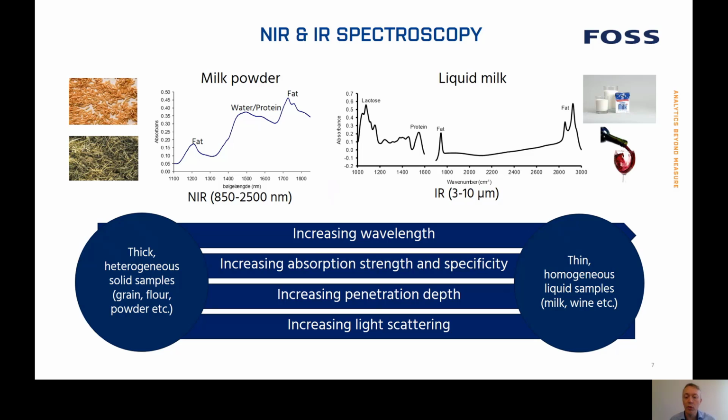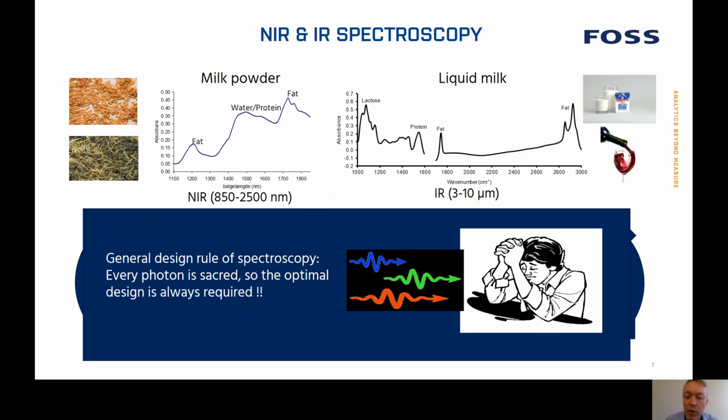In this webinar, we focus on the NIR applications, but no matter which part of the spectrum you use, you want the best possible use of your light in the spectrometer, which we will also dig deeper into.